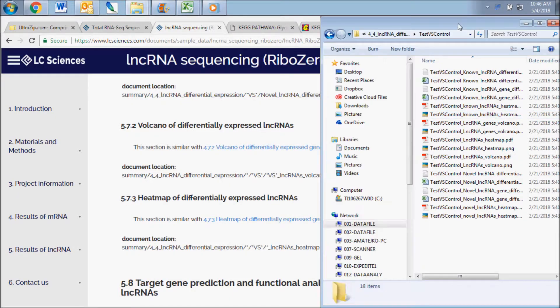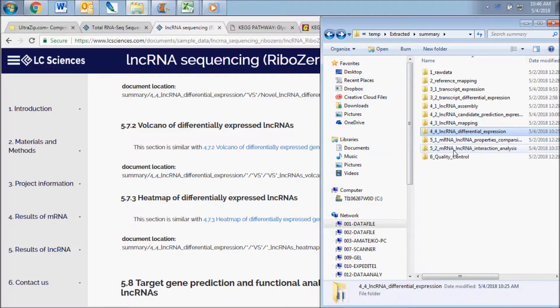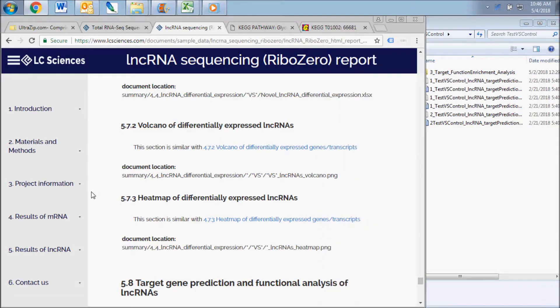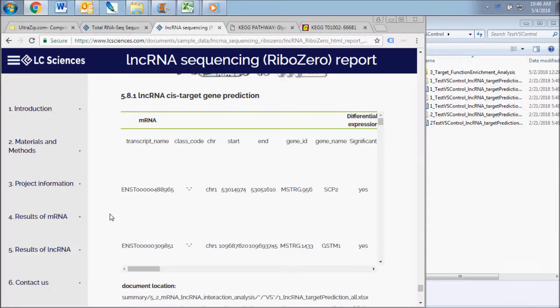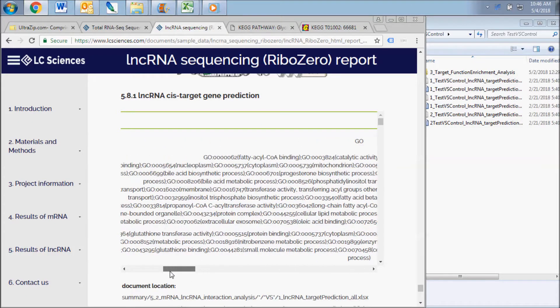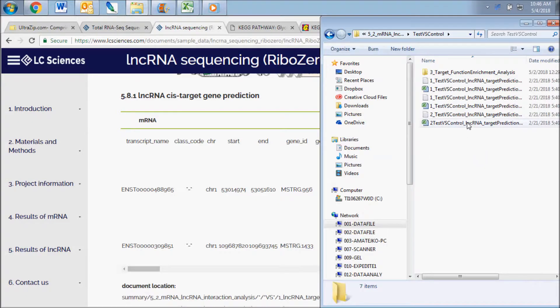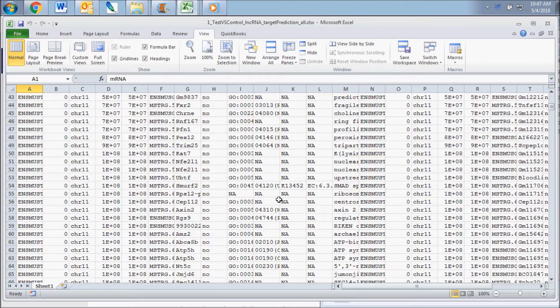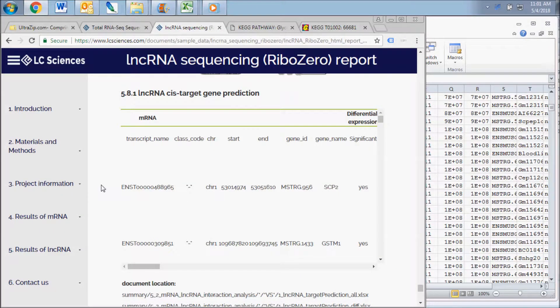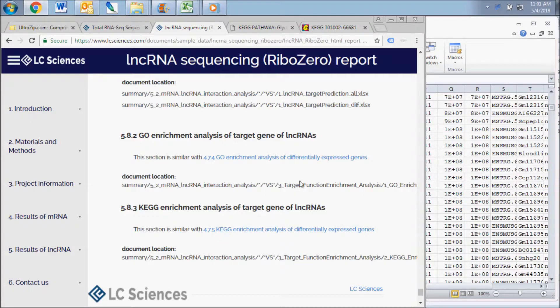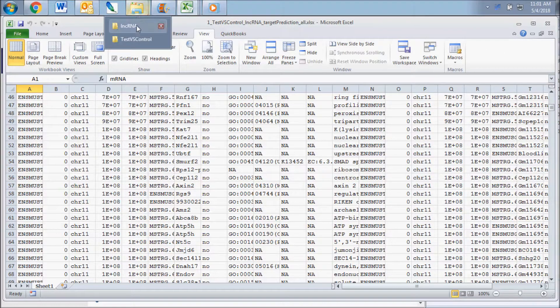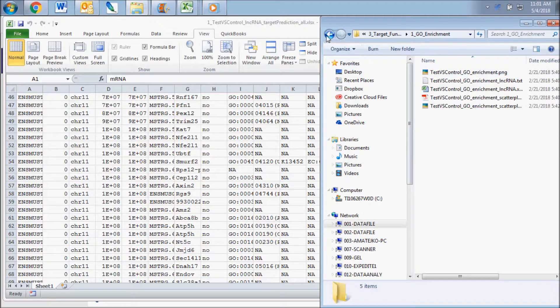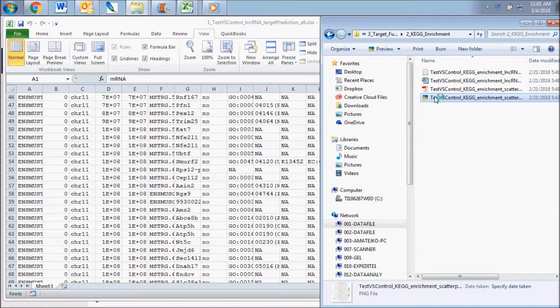The next results subsection displays the data contained in the mRNA long non-coding RNA interaction analysis folder. Here again, you will find a subfolder for each of the group comparisons specified on your analysis request form. The chart includes the predicted target genes of long non-coding RNAs that were differentially expressed in your comparison. A data file containing the target predictions for all of the long non-coding RNAs sequenced in your samples can be found in the same folder. The long non-coding RNA results subsection contains the functional analysis of the differentially expressed long non-coding RNAs, with subfolders for GO enrichment analysis and KEGG enrichment analysis, containing similar data to the mRNA functional analysis files.